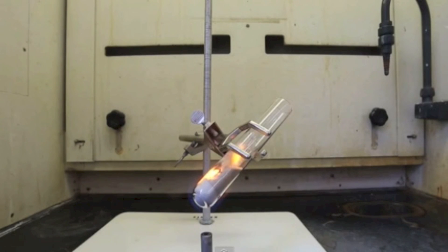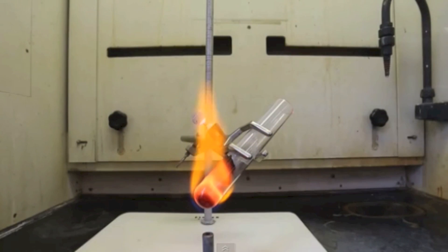The first reaction that occurs is that the magnesium combusts to form magnesium oxide, and in doing so, it strips off the oxygen from the silicon atoms to make elemental silicon.